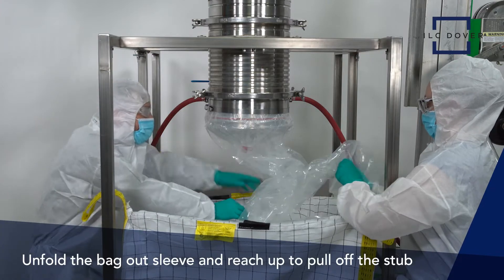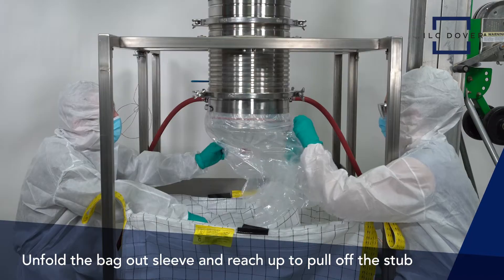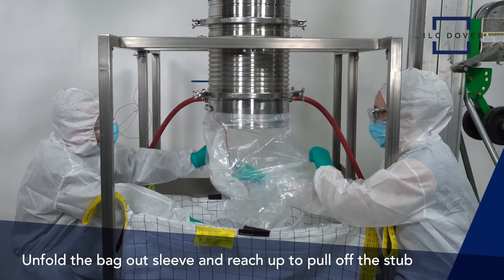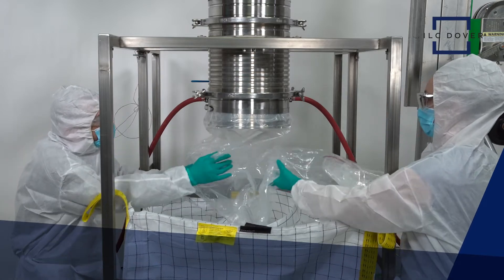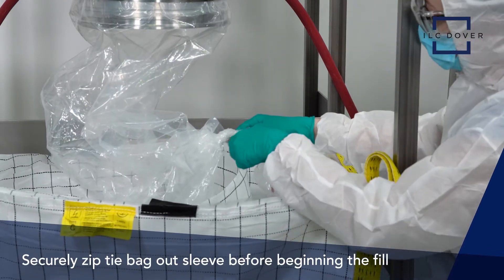Unfold the bag-out sleeve and reach up to pull off the stub. The bag-out sleeve ensures a contained switch-out between bags. The bag-out sleeve is then securely zip-tied before beginning the fill.